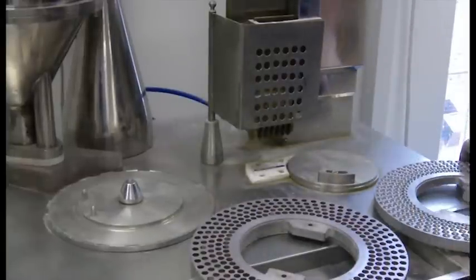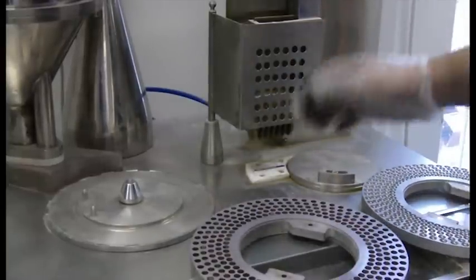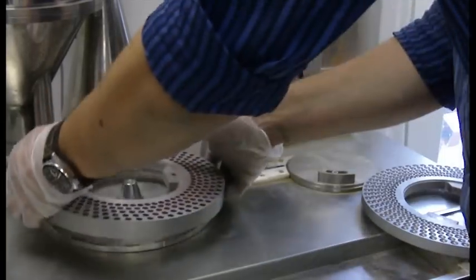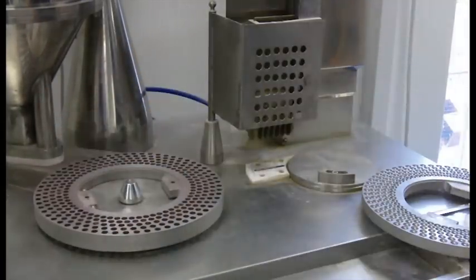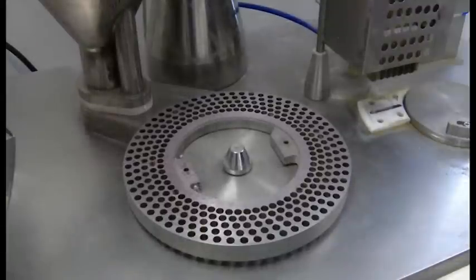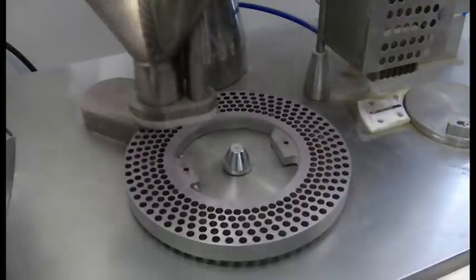This bottom section is then placed into the filling part of the machine. Once the plate has been placed into this section of the machine, the operator can switch on the filling.